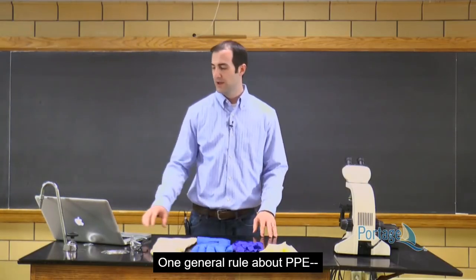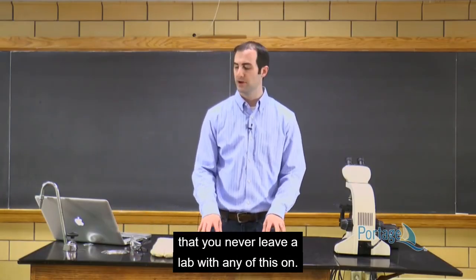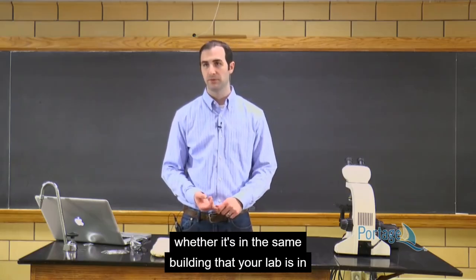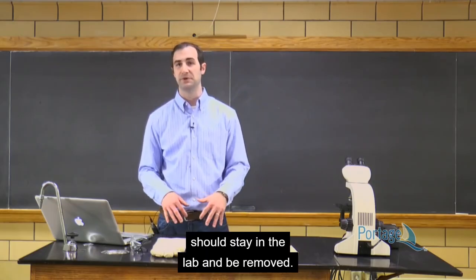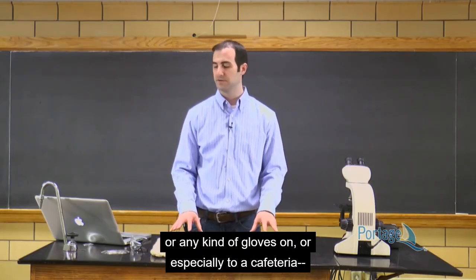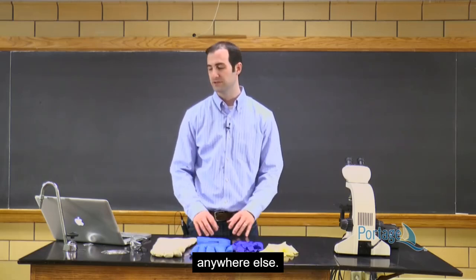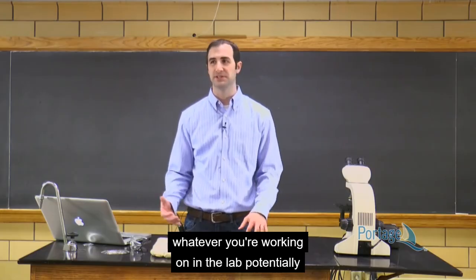One general rule about PPE, personal protective equipment, is that you never leave a lab with any of this on. You never want to walk into a public hallway, whether it's in the same building that your lab is in or not. All personal protective equipment should stay in the lab and be removed. So again, you should never be in a hallway. You should never go to the bathroom with your lab coat or any kind of gloves on, or especially to a cafeteria, anywhere else. You never want to see that. That's just a way of spreading whatever you're working on in the lab potentially to other outside areas.